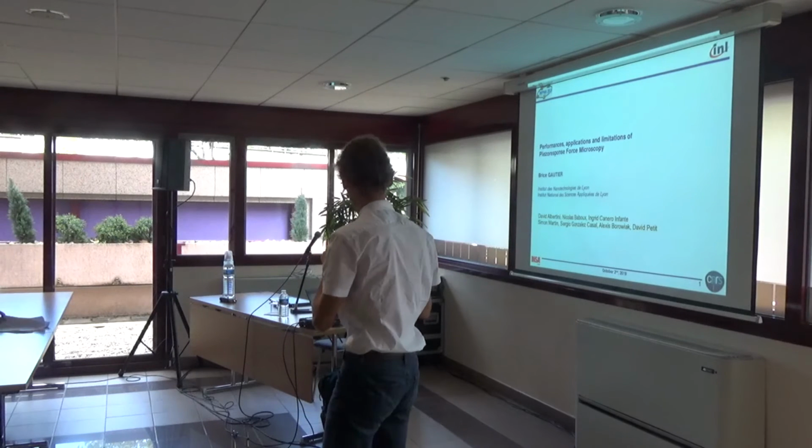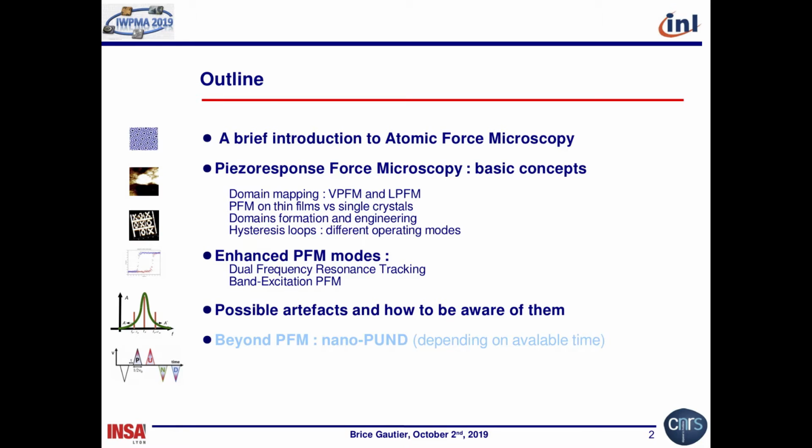And well, we'll try to understand the basic principle of piezoresponse force microscopy, and this is based on atomic force microscopy. So I will start by giving some basic information about atomic force microscopy. I apologize for those of you who already know about that, but it's very important that you are aware of the problems of atomic force microscopy before doing piezoresponse force microscopy.